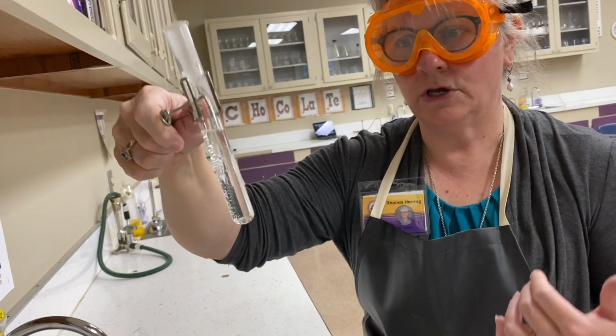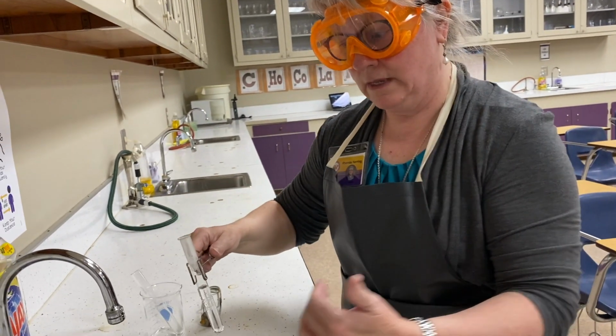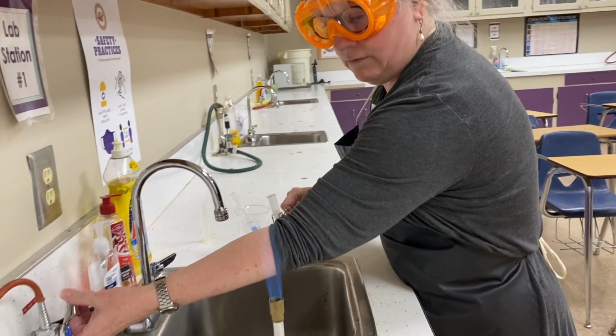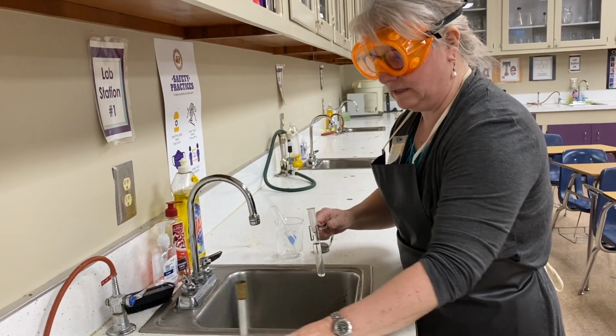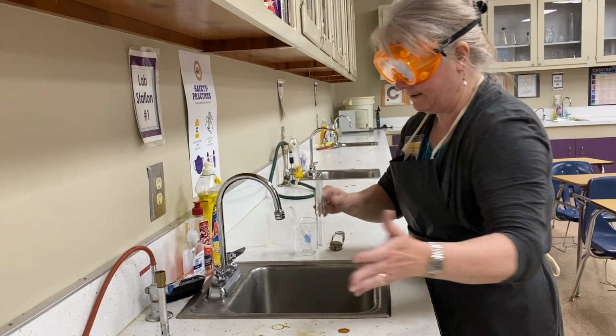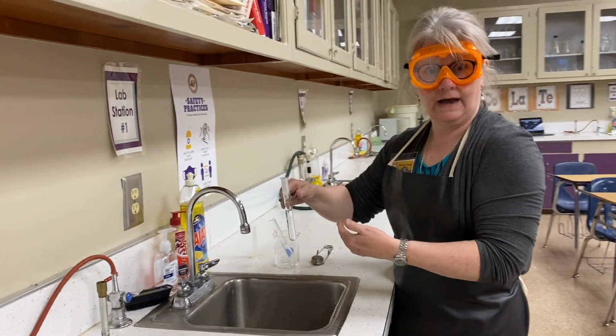Okay, so at that point I want to stop. I want to turn the burner off so that it is no longer part of my safety thoughts. Push it out of the way. This water is now hot.